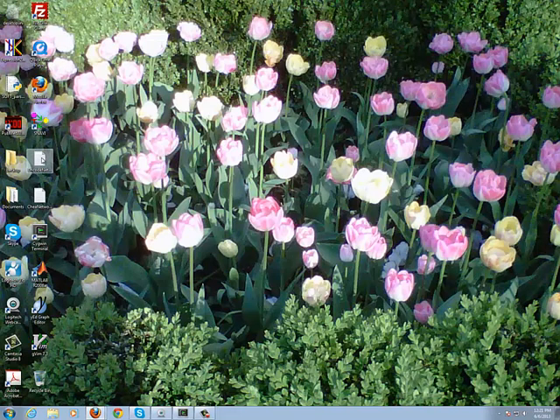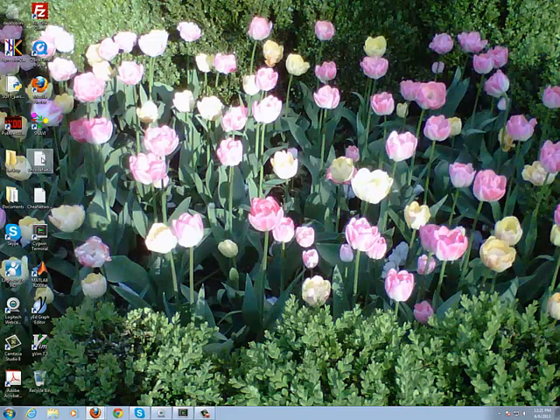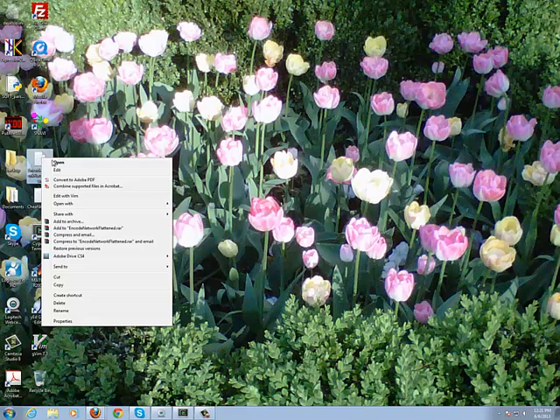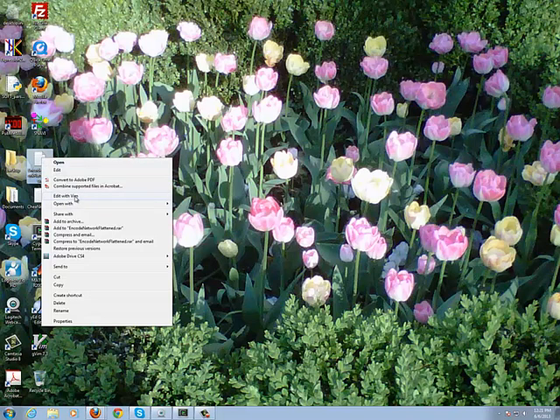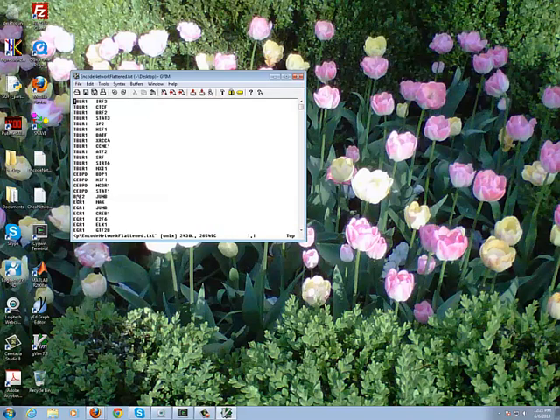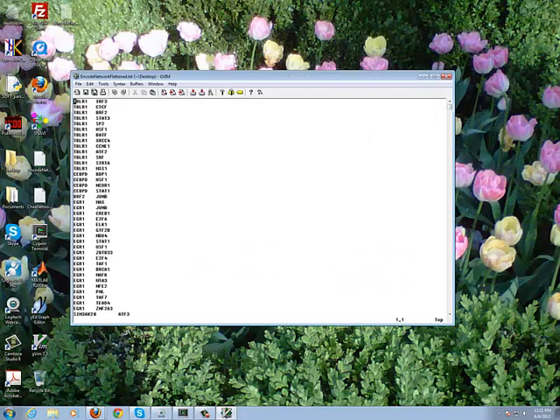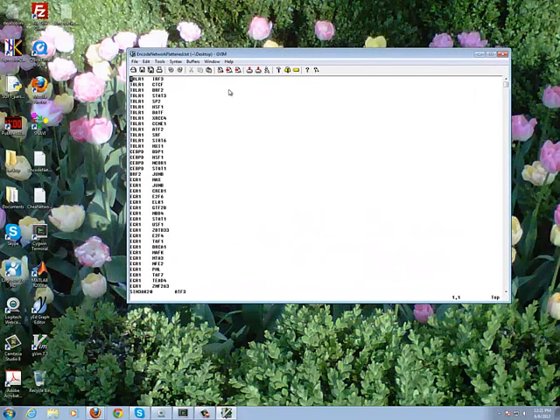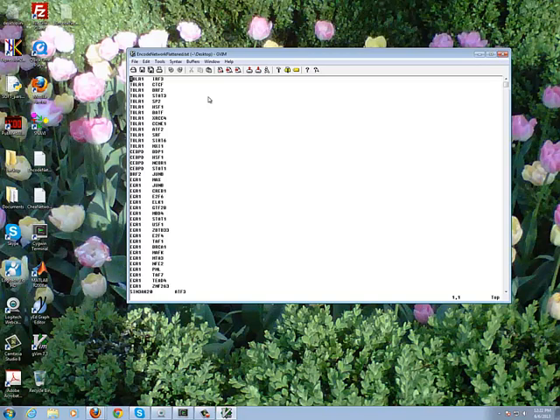And I would like to show you first the two text files that describe the network. So let's open them in a text editor. These are typical text files that you get or generate where you are listing all the nodes in the network in this interaction format. This is the node name, and so this is one transcription factor regulating another transcription factor.